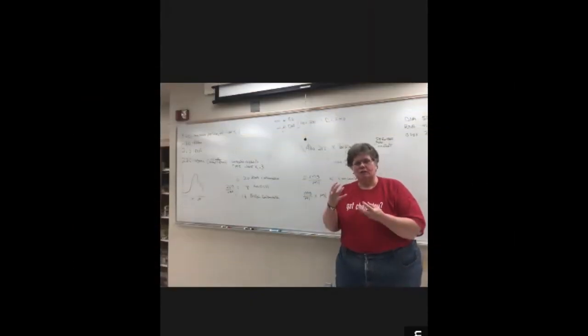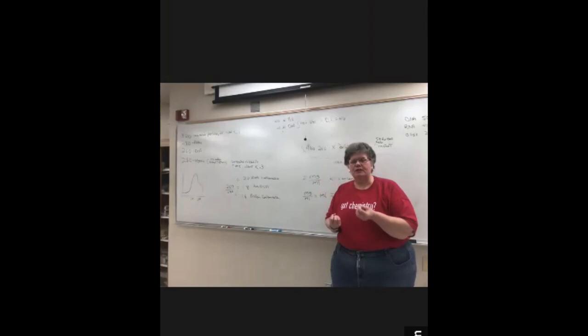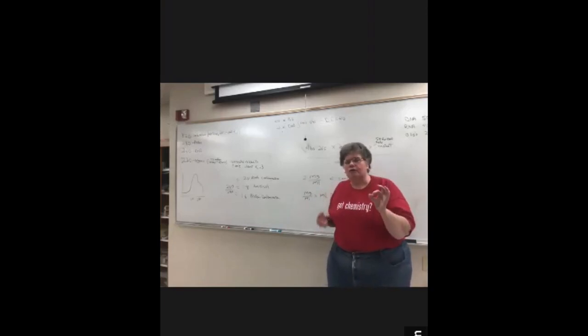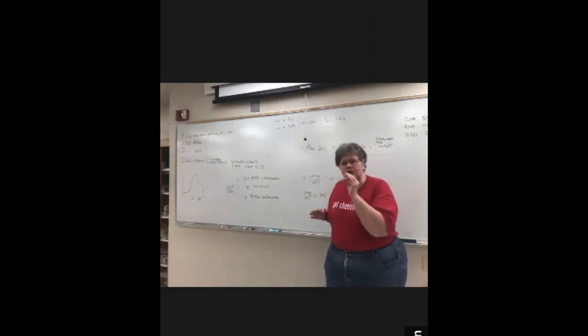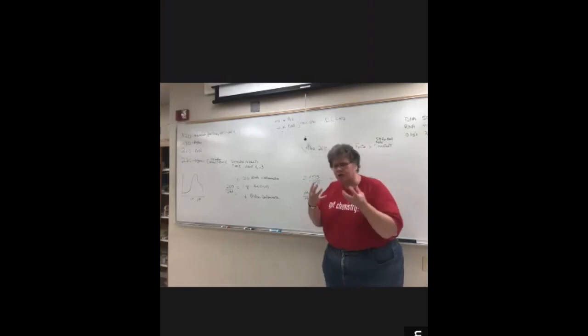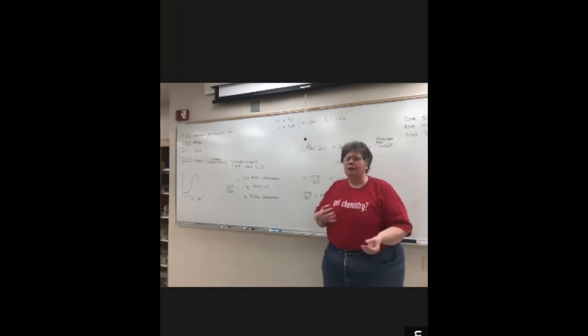After you finish precipitating your DNA in the tube, you're going to add TE buffer to resuspend the DNA. For this protocol, you're going to add 1 ml of TE buffer, and TE buffer is 10 millimolar Tris, 1 millimolar EDTA. It just keeps the pH constant, and it chelates those divalent cations to keep your DNA intact. But remember, you want to freeze your DNA if you're trying to store it long term. You never try to keep DNA in liquid form long term, because you will get some degradation of the DNA. So after you have brought up your DNA in 1 ml of the TE buffer, you're going to be diluting it.